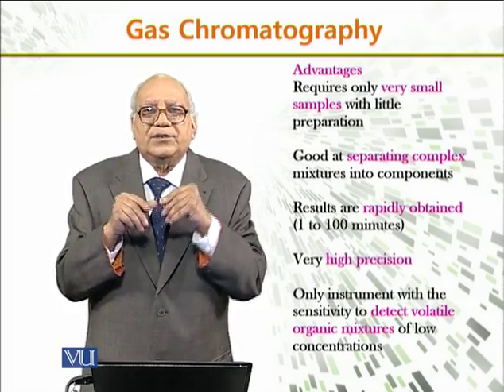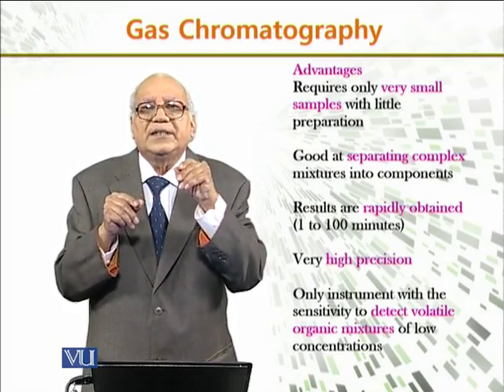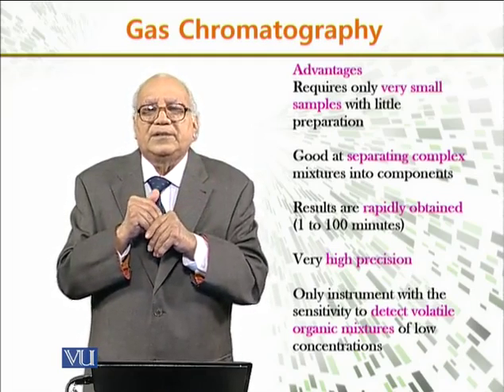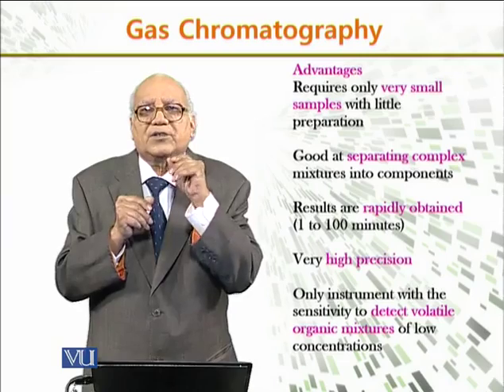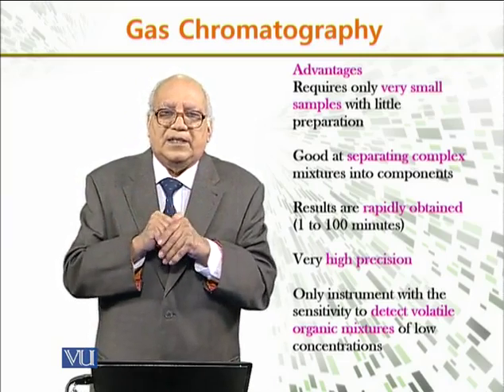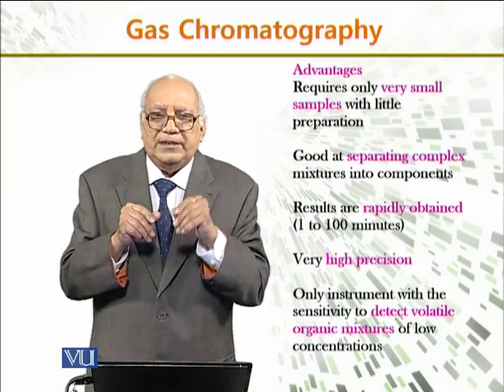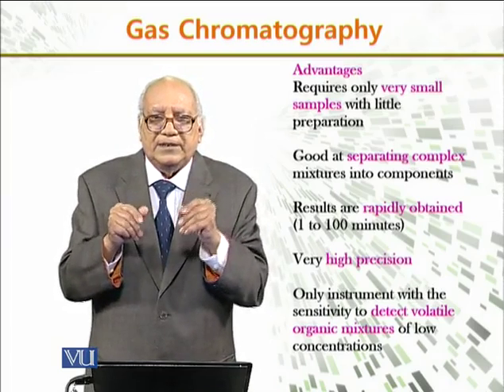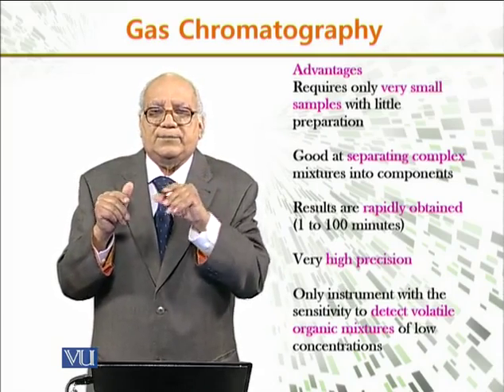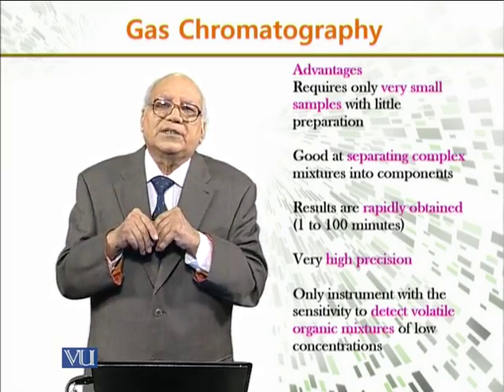Now, as indicated earlier, it is an extremely precise technique for use in analysis, and it is the only instrument with the sensitivity to detect volatile organic mixtures of low concentration.